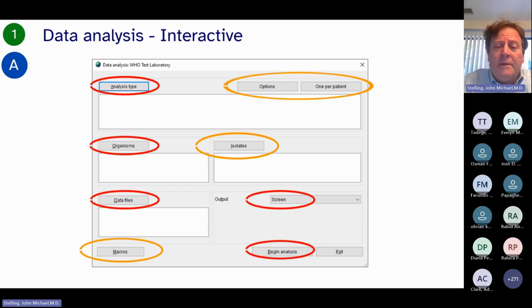E. coli, Staphylococcus aureus, all gram-negatives, parasites. WHONET was primarily developed for antimicrobial resistance to study bacteria and fungi and their resistance. In WHONET, we have also included viruses, parasites, other values such as no growth, normal flora. So WHONET is not only for resistance, it has special uses for resistance, but it can be utilized for other elements of the laboratory data.